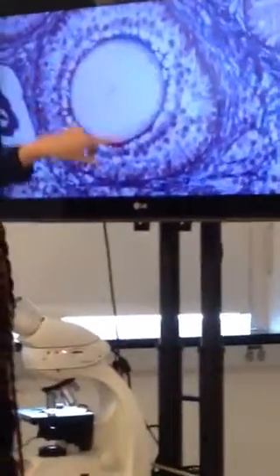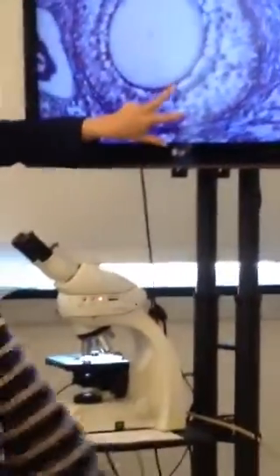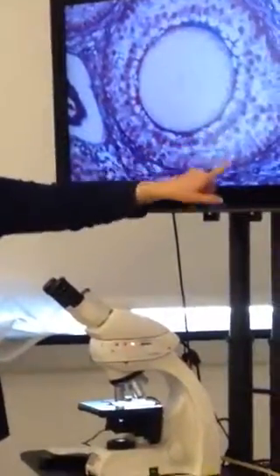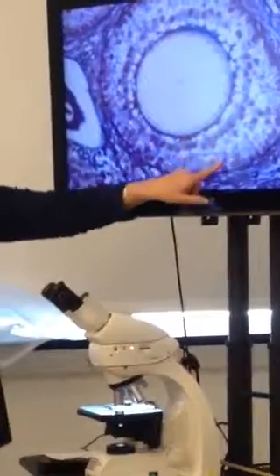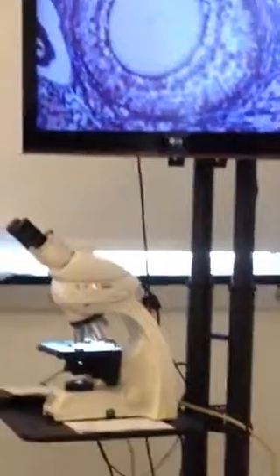So under this now is what they call a primary follicle. Starting at puberty, a few follicles are going to get recruited, and they're going to turn into this. So you see the difference? There's a huge egg. It's gigantic. We're not seeing its nucleus right now, but sometimes you would. And see how it used to be just one layer of flattened squamous cells, and now it's like 3 or 4 layers. So the egg actually doesn't change at all. It's these cells that change. The squamous cells divide and become cuboidal looking. So that's called a primary follicle.